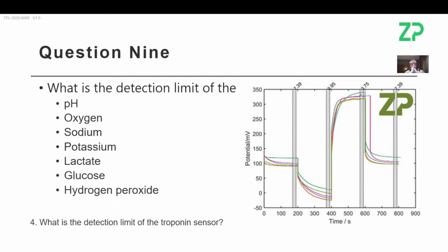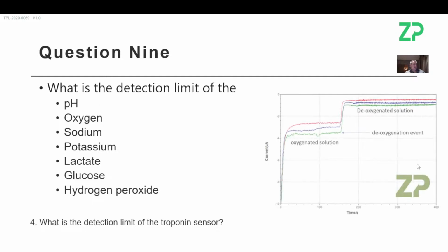pH 0 is pH 7. It's very easy for us to detect pH 7, let's say. So I think it's a slightly wrong question. Our sensors work at pH 7, pH 10, pH 4. I think we've gone to pH 2. So we have quite a range on our pH sensors. So I don't think the question, the pH of 0, as I say, is actually... pH 0 protons is essentially pH 7, which is neutral, and that's well within our test.